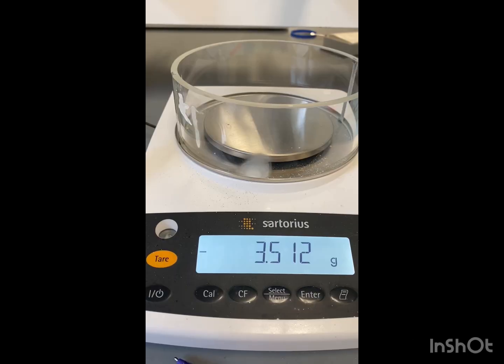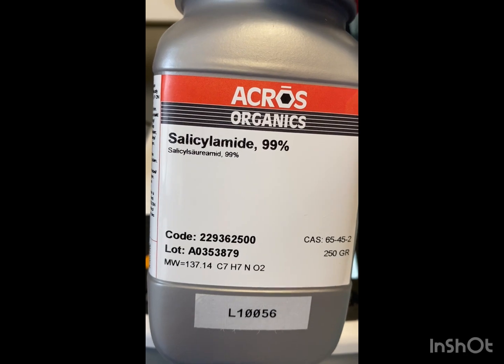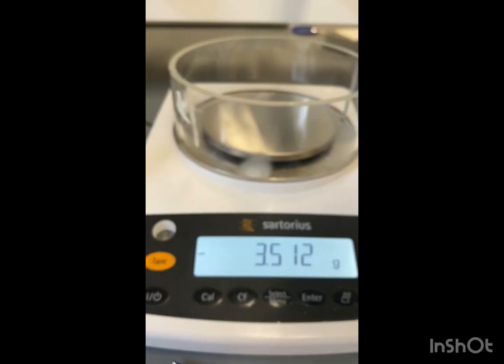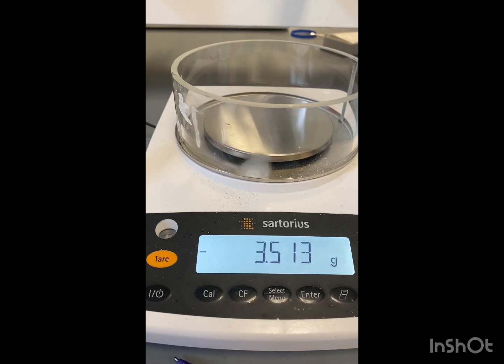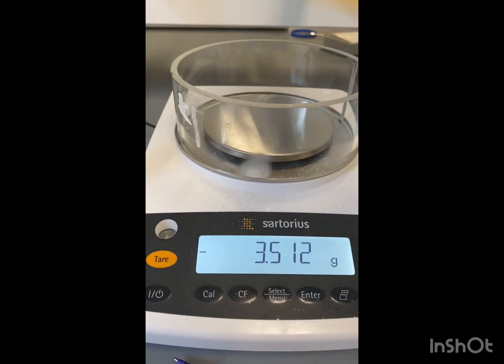Now that we have our safety glasses and gloves on, we're going to take around 250 mg of salicylamide and around 5 ml of our absolute ethanol and we're going to put that into our reaction flask.